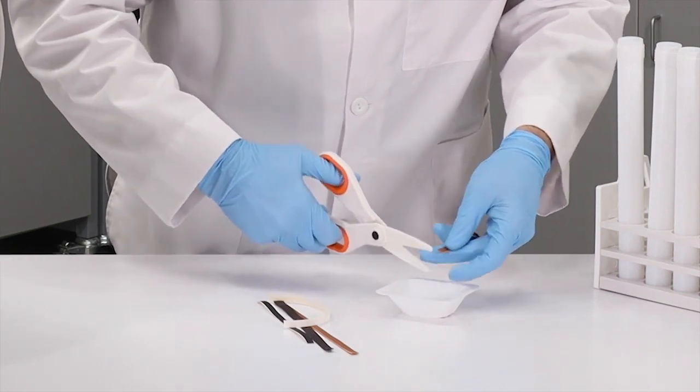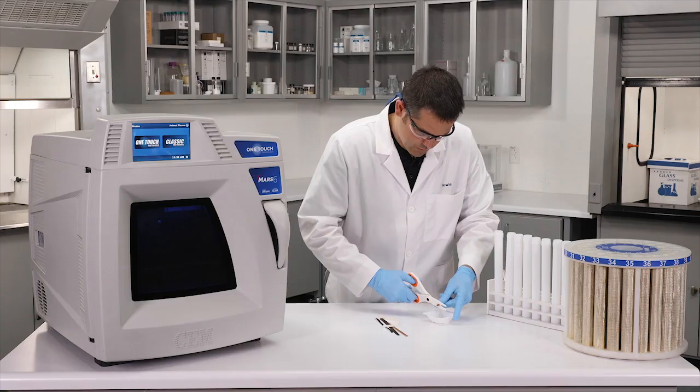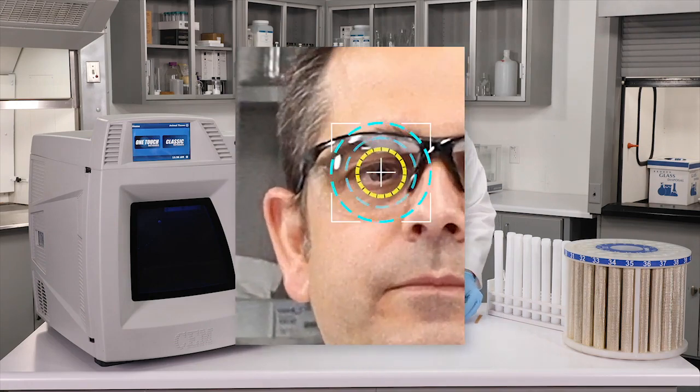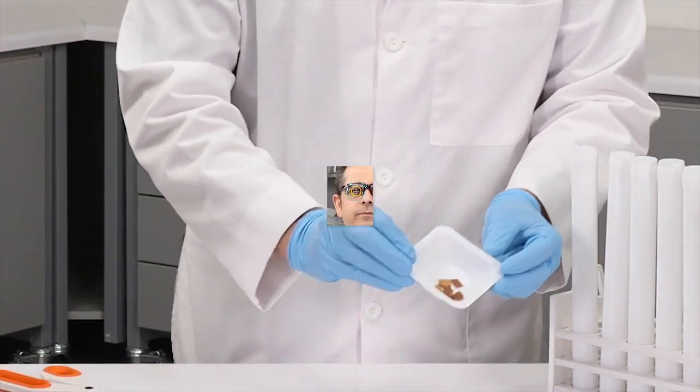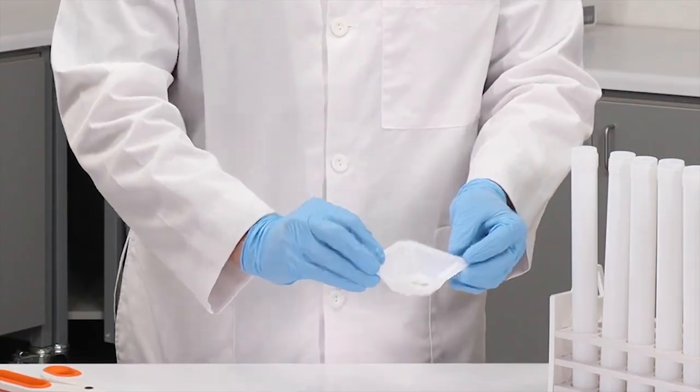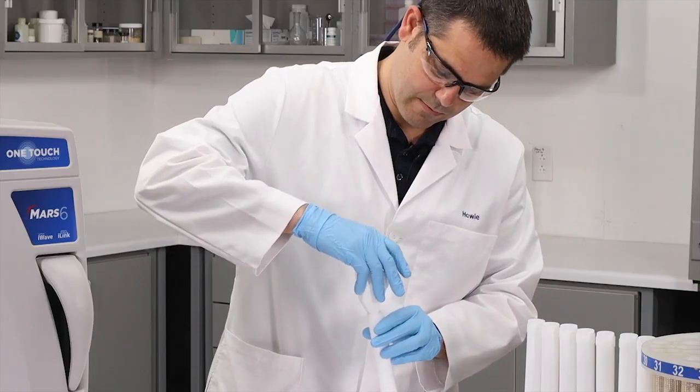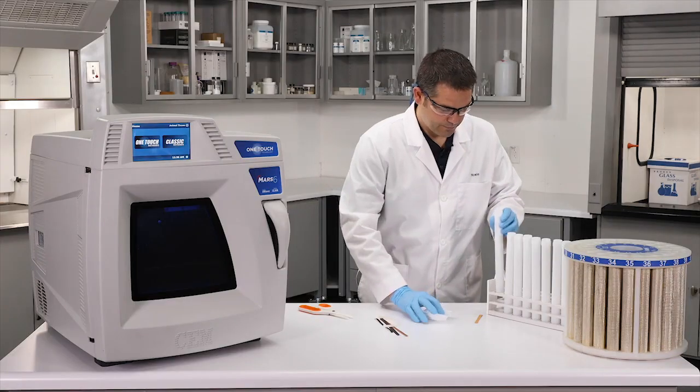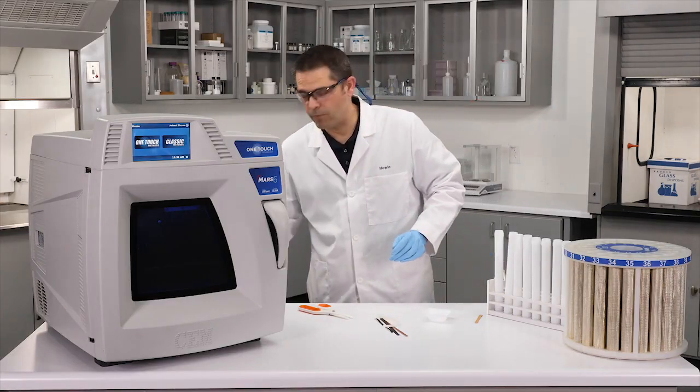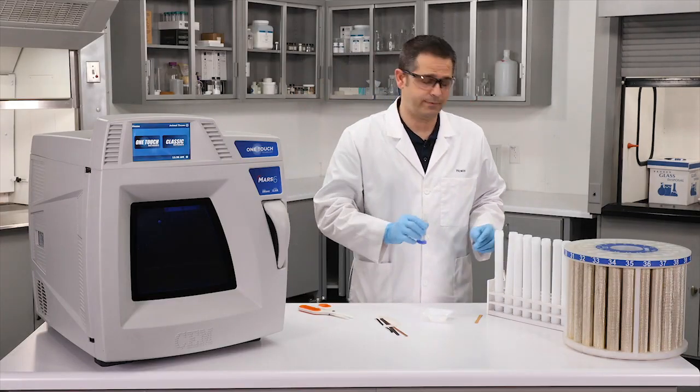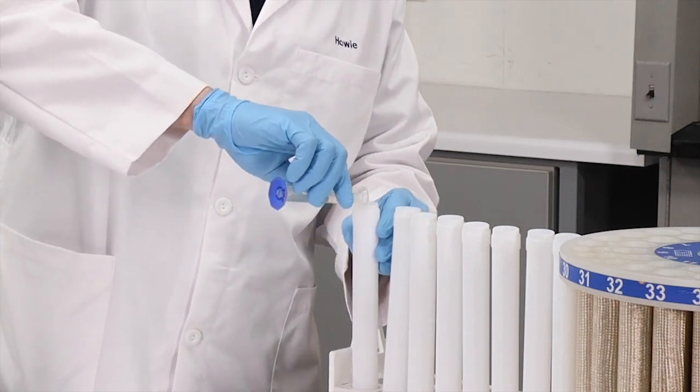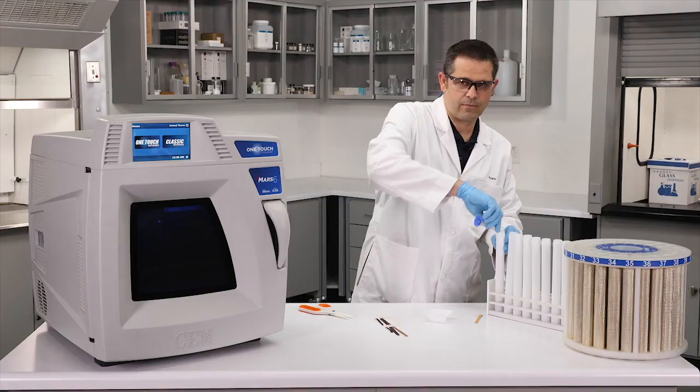All right, we're gonna cut a few more. And once again, using my calibrated eye, we're gonna start with about a half a gram of material. Let's get this into the vessel. All right, and we're gonna add our 10 mils of nitric acid.